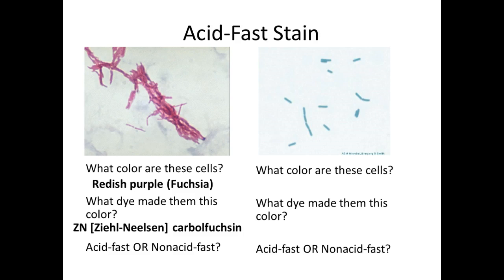Unlike the gram stain, where usually we say gram positive and gram negative, for this we say acid-fast or non-acid-fast. But you could say acid-fast positive and acid-fast negative. Traditionally, though, we say acid-fast or non-acid-fast.